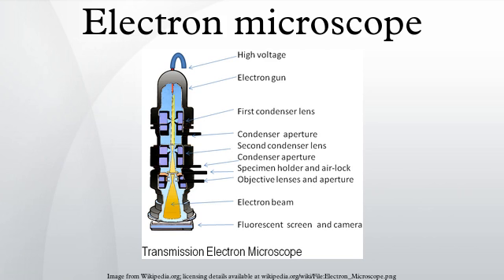In a similar method, secondary electron and backscattered electron detectors are superimposed and a color is assigned to each of the images captured by each detector, with an end result of a combined color image where colors are related to the density of the components. This method is known as density-dependent color SEM. Micrographs produced by DDC-SEM retain topographical information, which is better captured by the secondary electrons detector, and combine it with the information about density obtained by the backscattered electron detector.